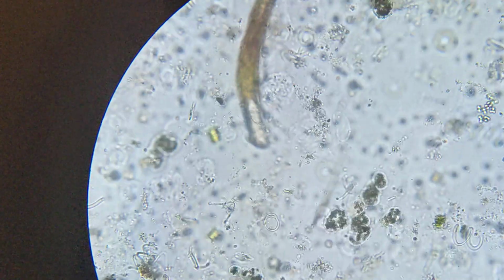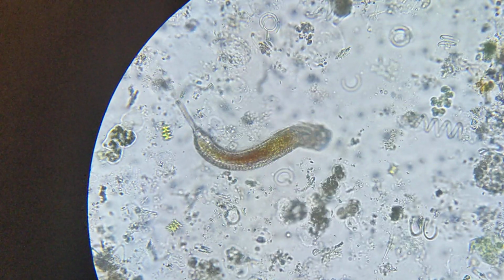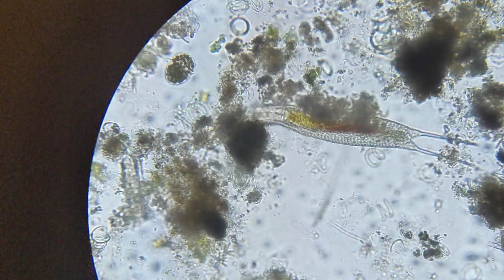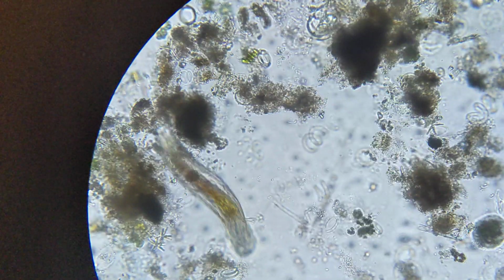That's part of the environment selecting. Hard to tell. It does seem to have cilia all throughout its sides, and I realize that cilia might be the wrong term, but little bristly hair-type things that it uses to move around, which does make me think that perhaps this is a gastrotrich.